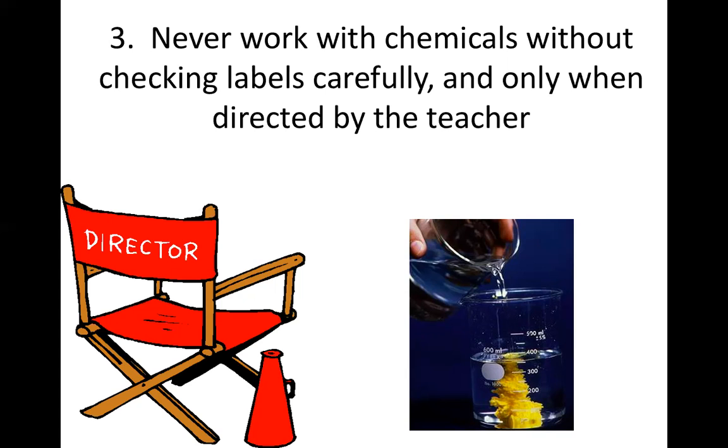So you have to know what kind of chemicals you are dealing with. And of course, you only use chemicals as directed by the teacher. So if the teacher says you have to use hydrogen peroxide, you only use hydrogen peroxide and not any other chemicals that are available in the laboratory. For this school year, you will be using chemicals that are available within your home. So basically, these are chemicals that you can find in your kitchen.